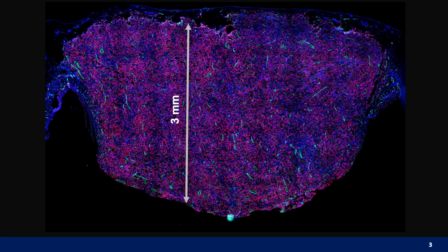In fundamental and preclinical cancer research, intravital microscopy is important to study tumor cell invasion, metastasis, and tumor stroma interactions. However, tumors are dense and opaque, and this causes strong light scattering, which distorts focal spots and deteriorates the fluorescence signals. So this makes deeper imaging very difficult.